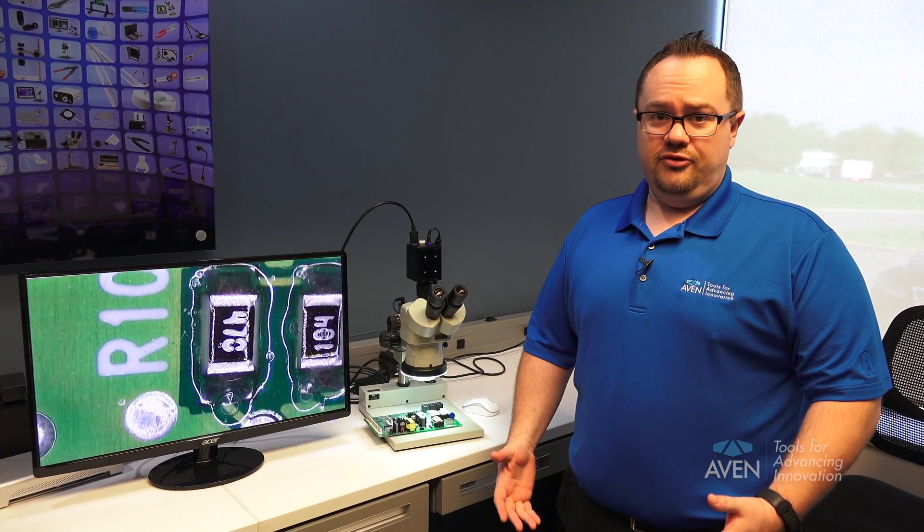Hi, I'm Tim Nelson, Director of Business Development for Avon Tools. Today I'm going to show you how to parfocal a stereo zoom microscope.